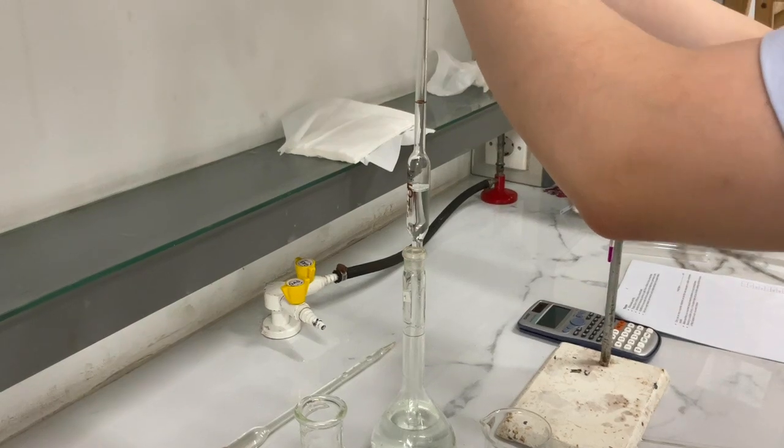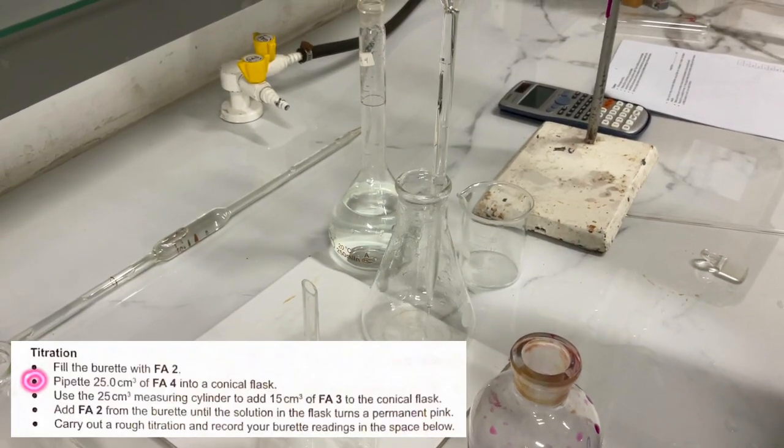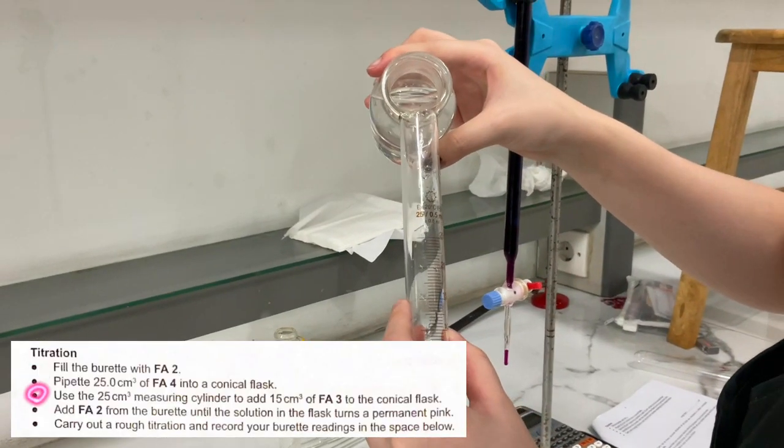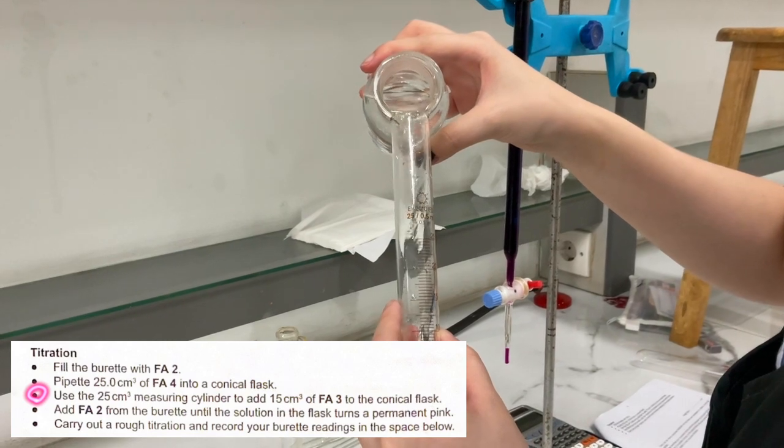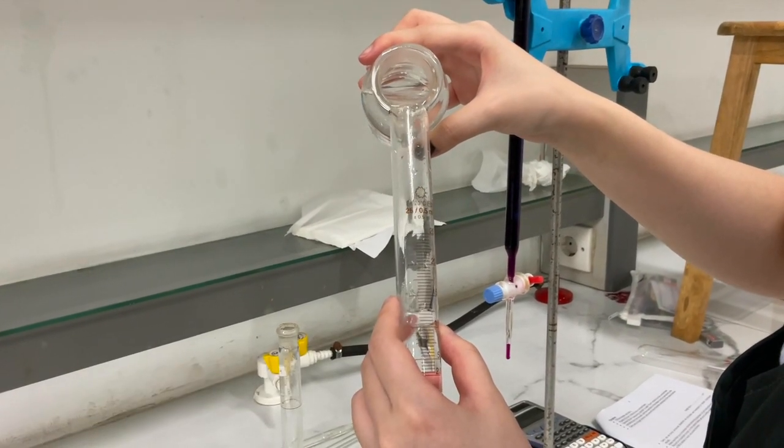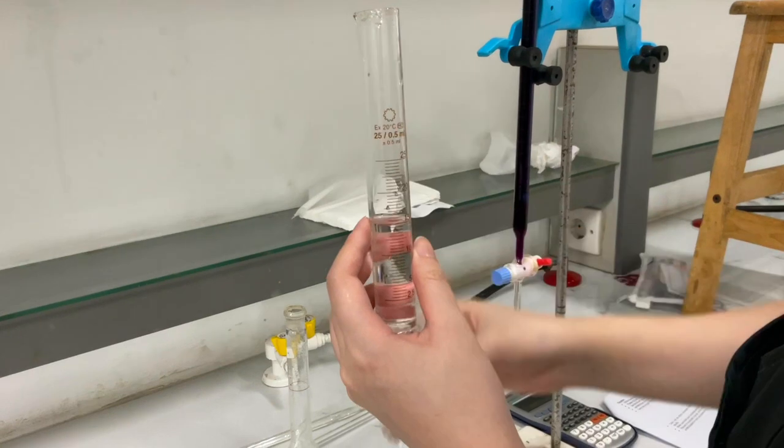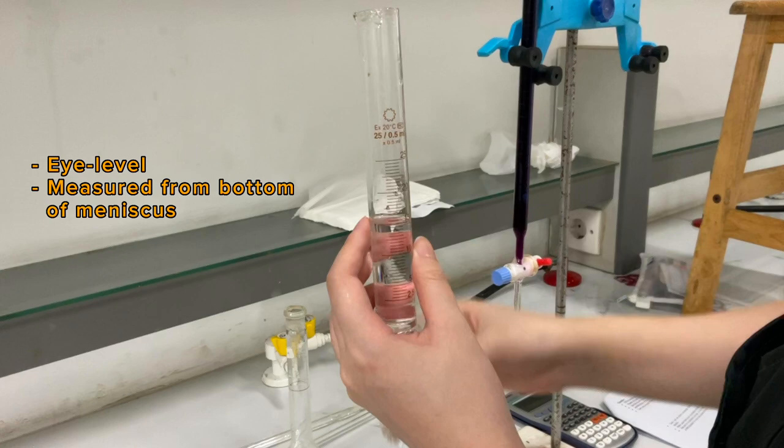Next, put 25 cm³ of FA4 into the conical flask. Then, use the 25 cm³ measuring cylinder to add 15 cm³ of FA3 into the conical flask. To get accurate results, the measuring cylinder should be viewed at eye level, and the bottom of the meniscus should be at the 15 cm³ mark.